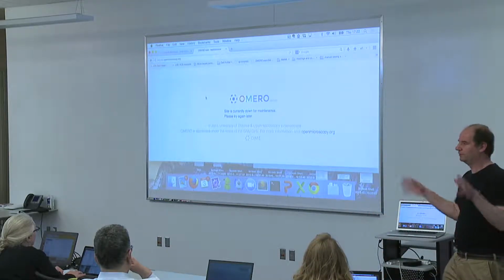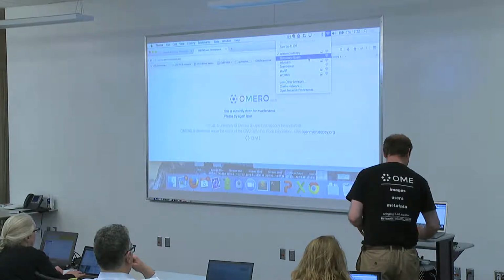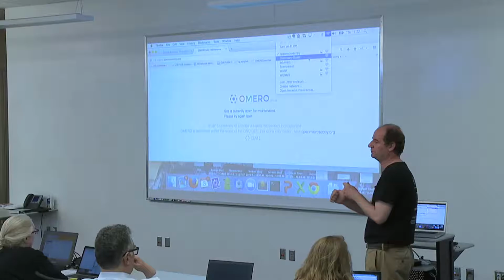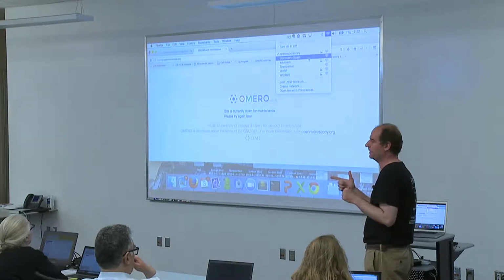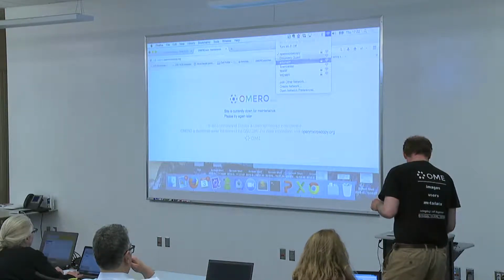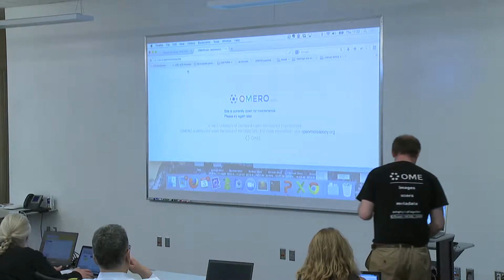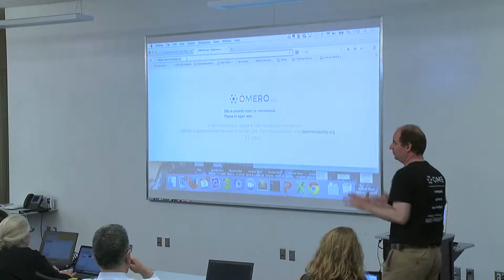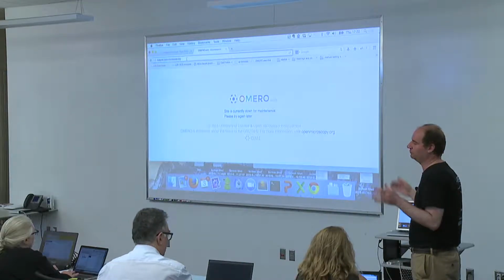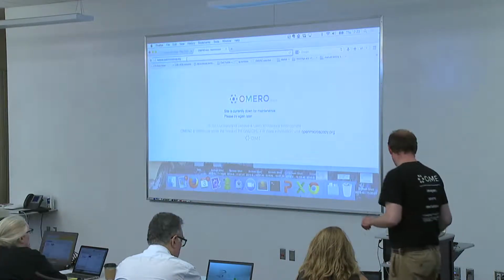Hopefully you somehow got to, so please go to the normal internet, okay? Just like this. If you have the clients, don't worry about anything I'm doing now. Who doesn't have the ImageJ plugin yet on the machine? Who doesn't have the OMERO Insight now? Just raise the hands properly so that I can see. Like 6 people. Okay. What you need to do is to go to the Discovery Guest Network, just the normal internet. Once you do it, you go to a site called Open Microscopy, one word, openmicroscopy.org, and there click on downloads, and you will find those two items I'm talking about. I will leave you to it.